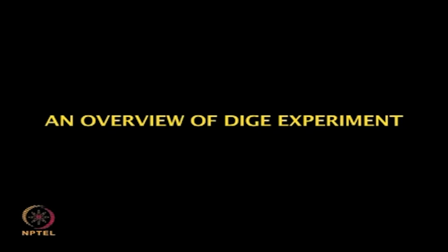So Dr. Srinivas, it was very useful to get a glimpse of the overall process in DIGE technology. Would you like to elaborate or demonstrate in some more detail the steps involved in the labeling of this technology? Yes, there is another video which you can see now. This is the second video, where you can see it more elaborately. This is a protocol developed particularly for membrane protein analysis. Now you can see this video.